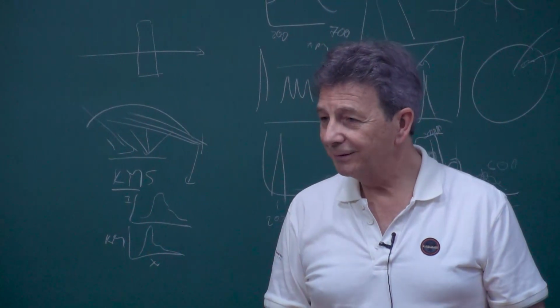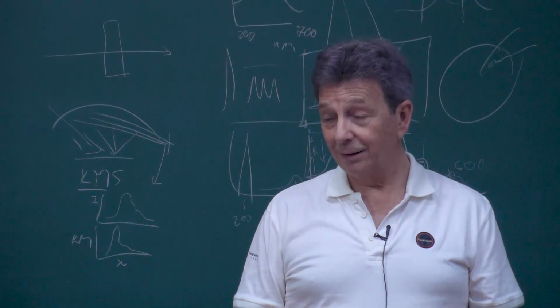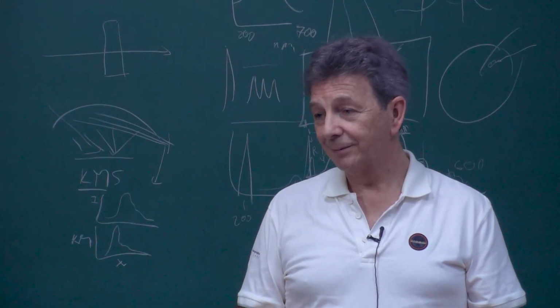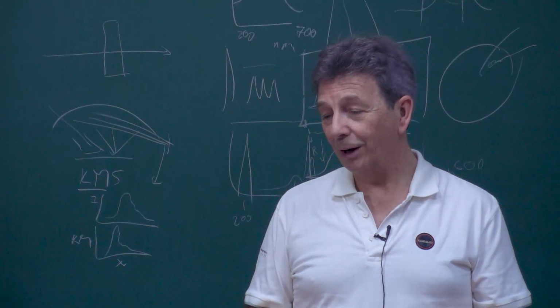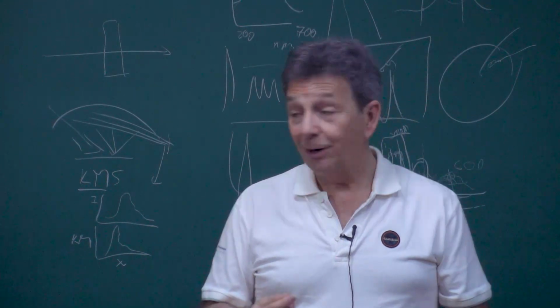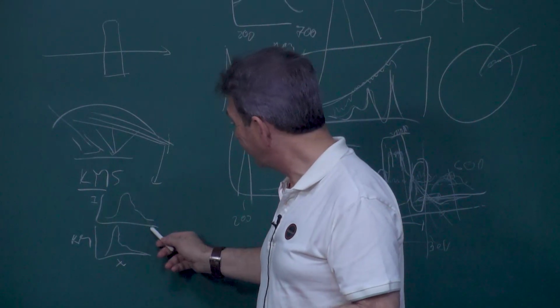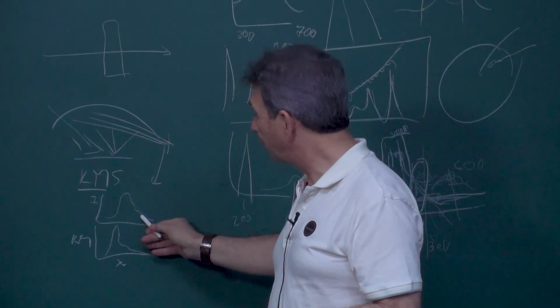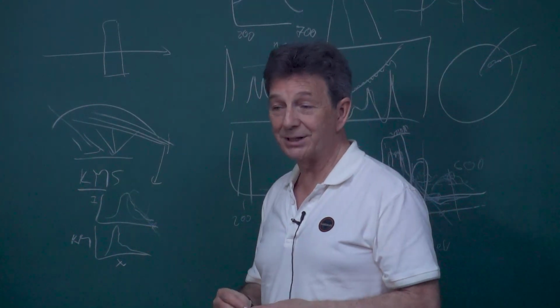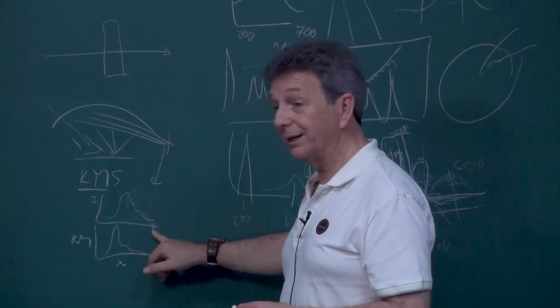And how is it helpful for band gap determination? How is it used to calculate the energy? Well, I made here just a drawing, extrapolating like that, but usually you have an equation to calculate it from this region. I don't remember exactly how it is, but that can be easily found. But there is a way to calculate the gap energy.